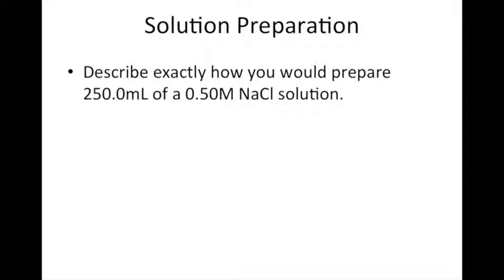So let's look at an example and use this to go through the steps to prepare a solution. It says describe exactly how you would prepare 250 milliliters of a 0.5 molar sodium chloride solution. Take a minute, pause the video and think about how you might prepare this solution. Then we'll go over it together.